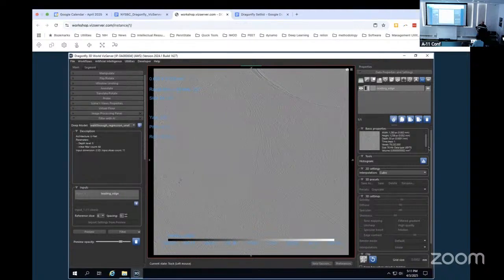We can wait for people to catch up. How do you tell if it is in the middle? So on this slice number, it'll just show a number right there. So I just put it on 25 out of 50. It's not critical by any means.